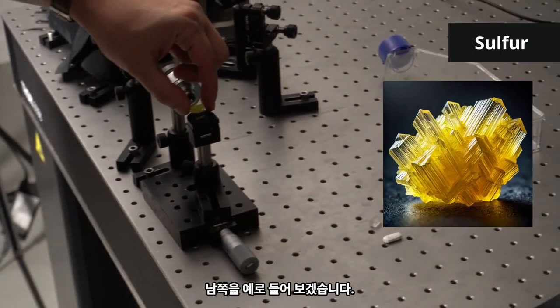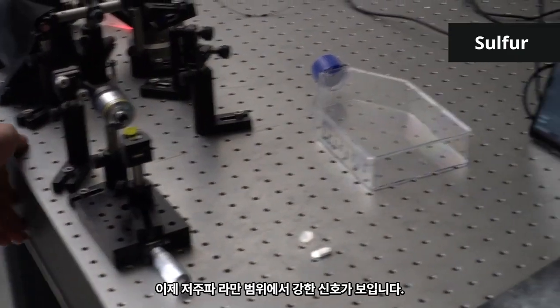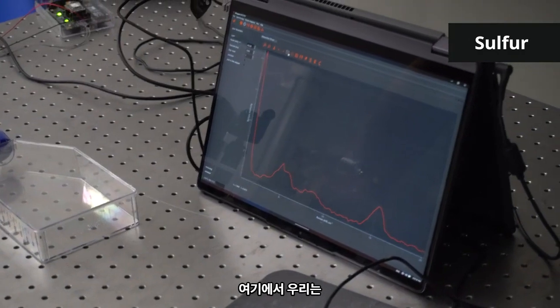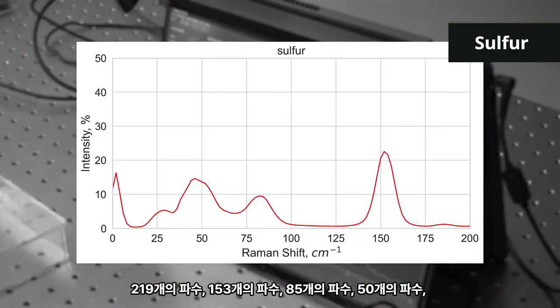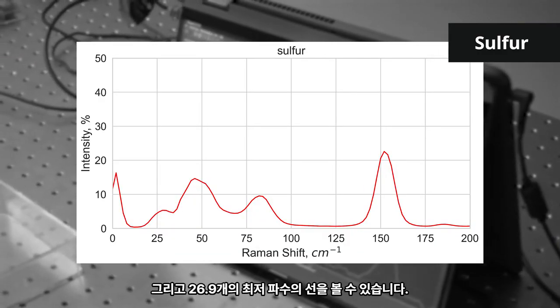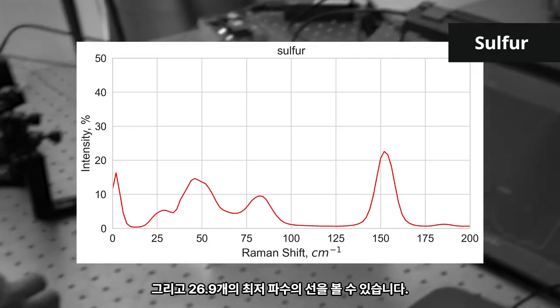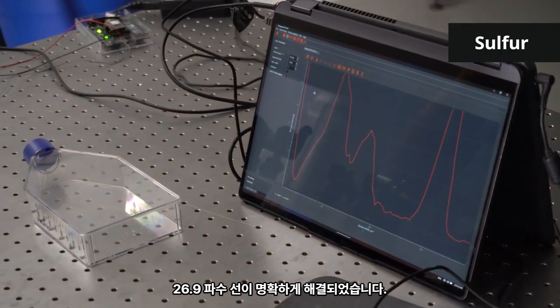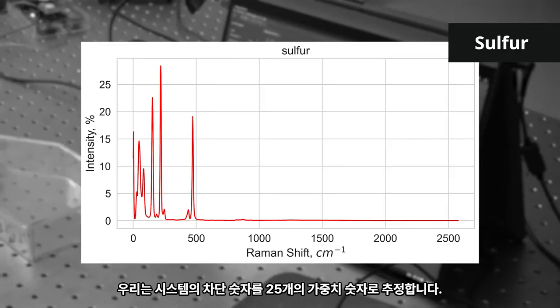Okay, let's take the sulfur sample. We adjust the focus a little bit, and now we see a strong signal in low-frequency Raman range. Here we can see the lines of 219 wave numbers, 153 wave numbers, 85 wave numbers, 50 wave numbers, and as low as 26.9 wave numbers. The 26.9 wave numbers line is clearly resolved. We estimate the cutoff of the system as 25 wave numbers.